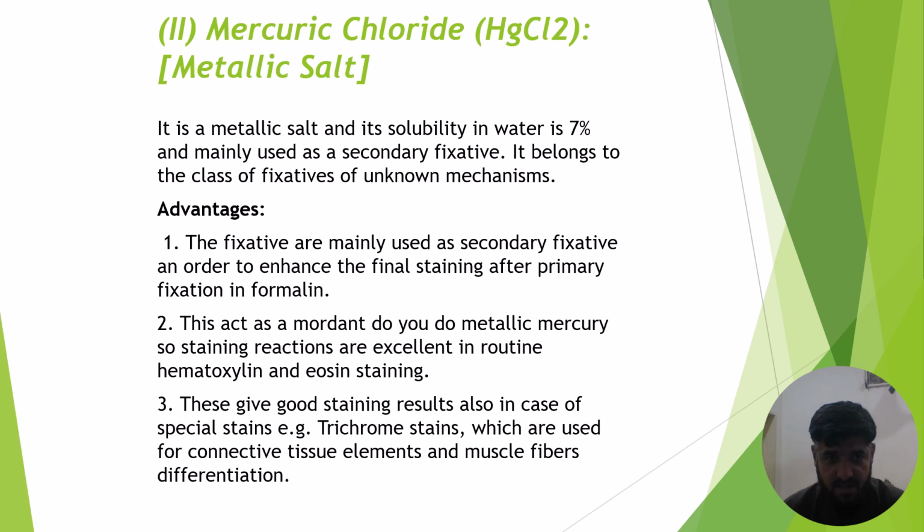This acts as a mordant due to metallic mercury, so staining reactions are excellent in routine hematoxylin and eosin staining. These give good staining results also in case of special stains like trichrome stain, which are used for connective tissue elements and muscle fiber differentiation.